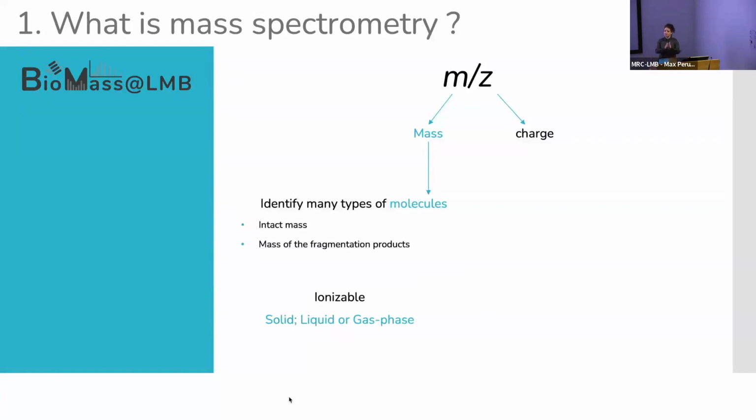So it's very easy. If we look at the isotopic distribution, and if you have high enough resolution to do so, and this gets very complicated when you have very large molecules such as intact proteins or even virus capsids, which we can also do with specific mass spectrometers, then you can see the isotopic resolution, you can determine the charge, and obviously from knowing the mass over charge, with the charge state, we can then calculate the mass. That's a very easy way to do it.